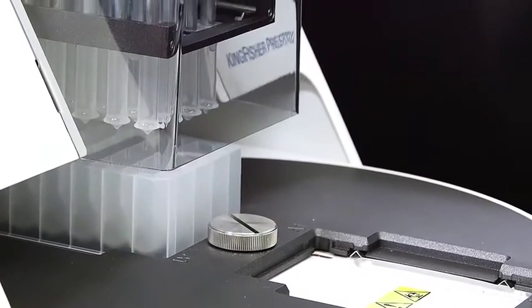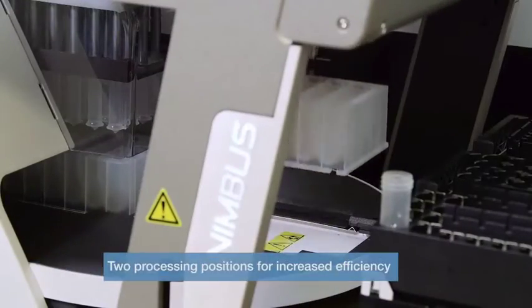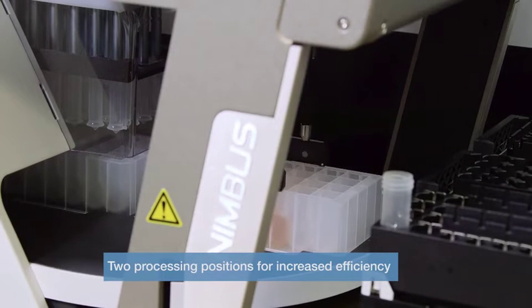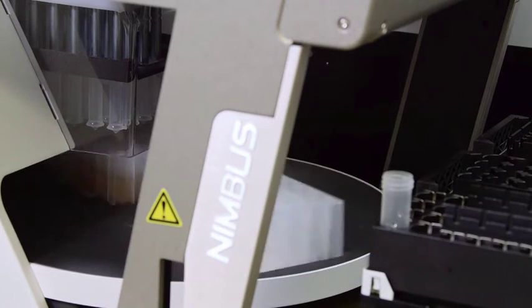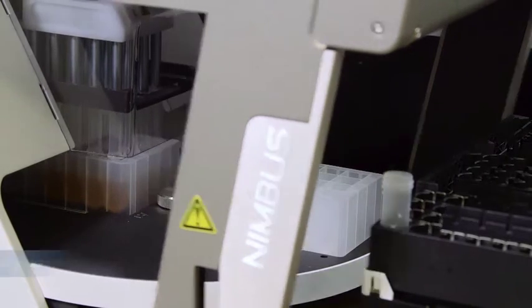The gripper arms transfer one plate to the loading position. The instrument then rotates the plate to the processing position under the magnetic head.